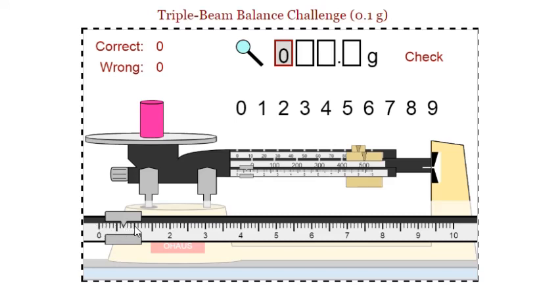So I have to think about what these additional little marks in between mean. Well, if that's 0 grams and that's 1 gram, and I've got 10 marks in between them, that tells me each of these is worth one-tenth of a gram: 0.1, 0.2, 0.3, 0.4, 0.5, 0.6, 0.7, 0.8, 0.9, and then up to 1 gram. Notice my little arrow is pointing at about 0.7.